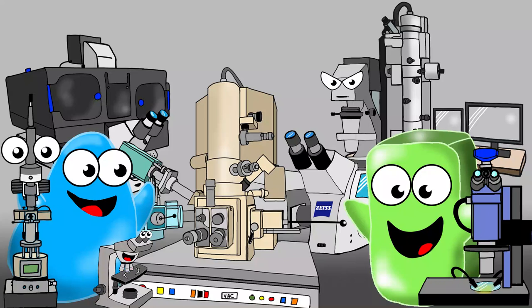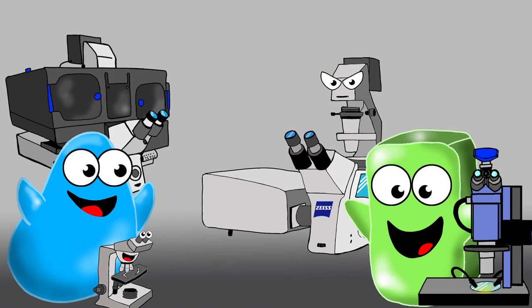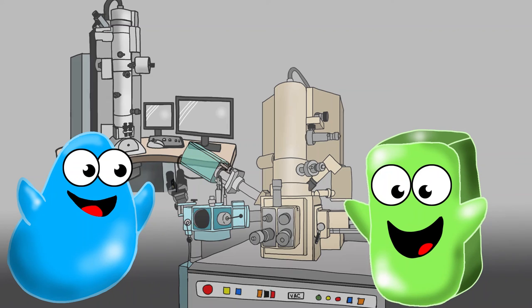So for things like cells and tissues, scientists can use a light microscope, but for smaller structures like viruses and proteins, they need an electron microscope. So now that you've learned about why we use different kinds of microscopes, let's go see them.